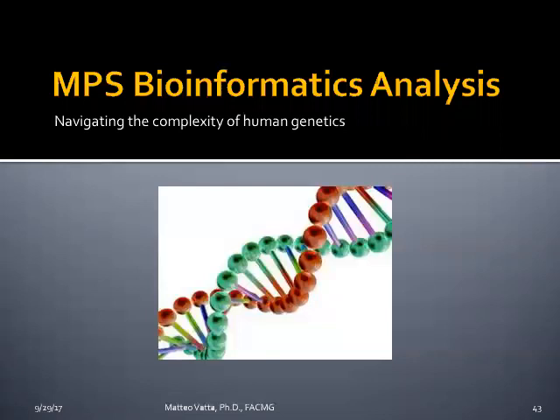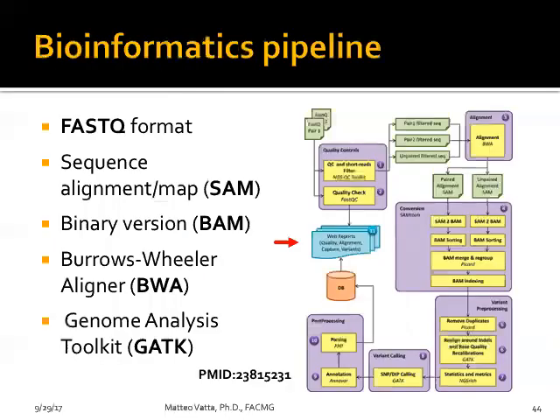Yeah. So, and then we go to the bioinformatic analysis. I will go very fast because otherwise, you will outperform me in this. But definitely, the most important thing to keep in mind is that the machine will produce a so-called FASTQ file, and then obviously you have to go through all those different software, and everything is changing. So this is an old slide, so probably it's already outdated completely.